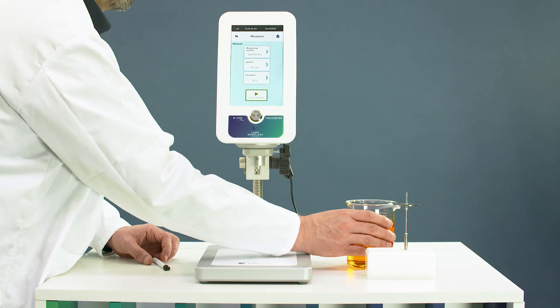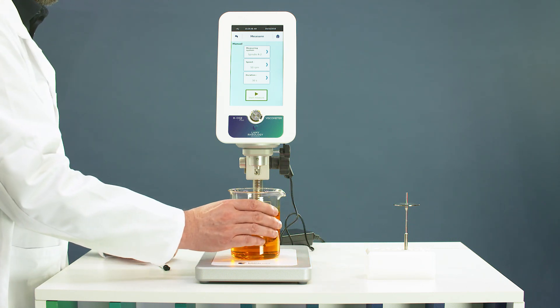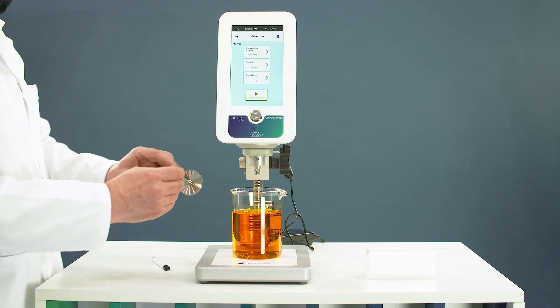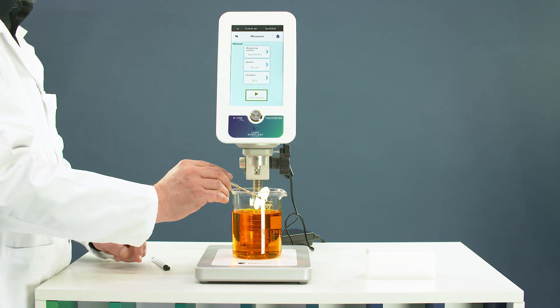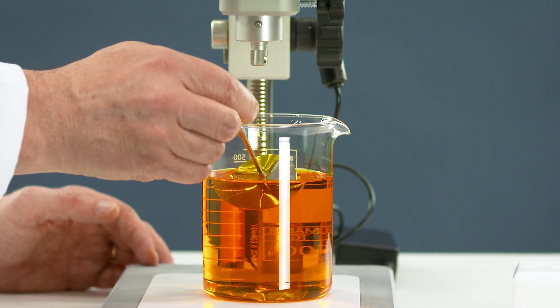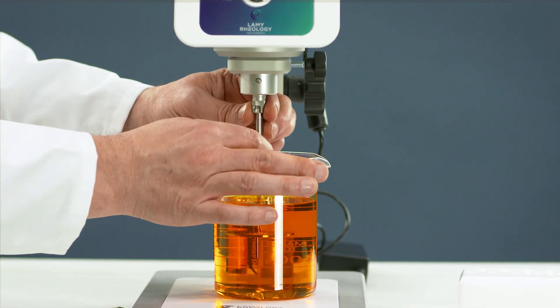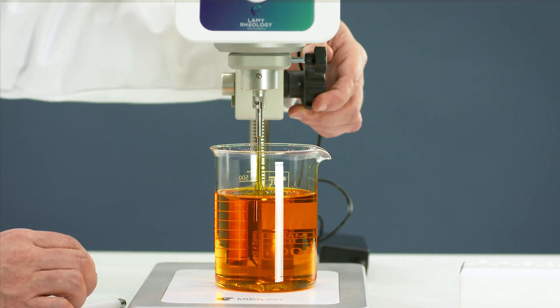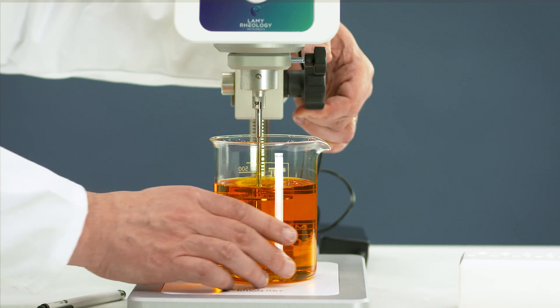Take the beaker with the sample and place it below the device. Take the spindle and tilt it obliquely to avoid air bubbles. Connect the spindle using the easy bayonet coupling, and reach the perfect position using the mark on the spindle's shaft.